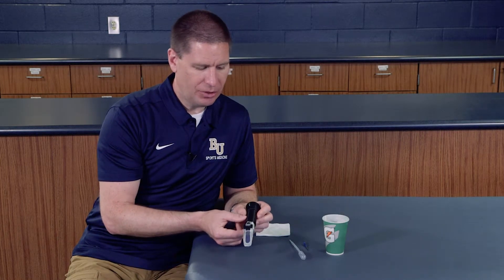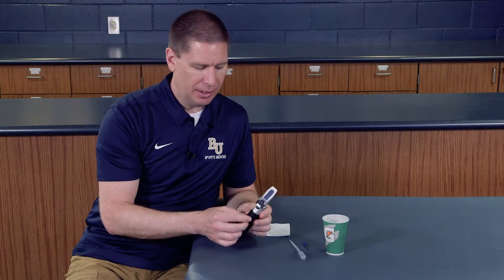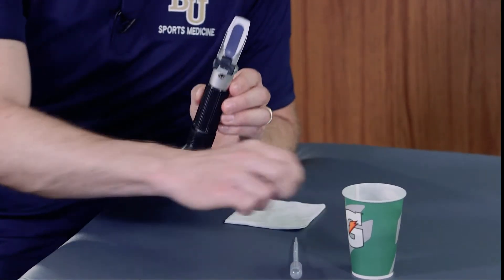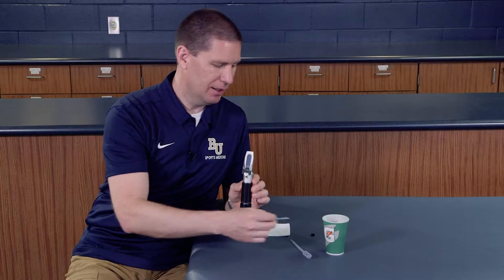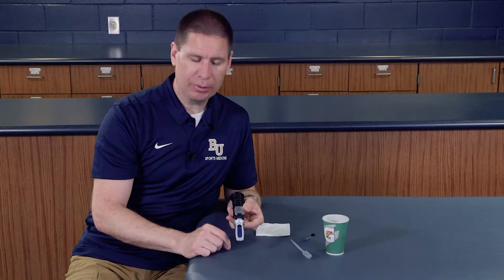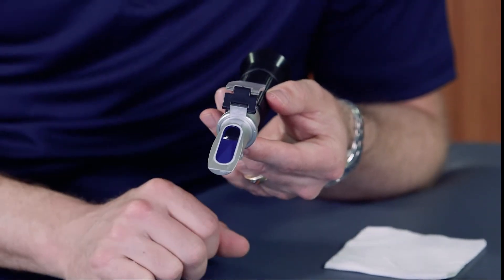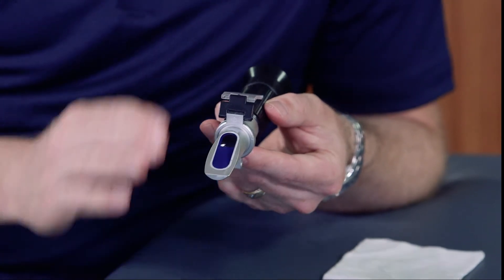There are a couple things to note ahead of time. You always want to calibrate this. There is a small screw right above here that allows you to adjust that. What you would do is add a little bit of distilled water directly onto the prism and then take your measurement and make sure that you have a nice, neutral level of specific gravity.